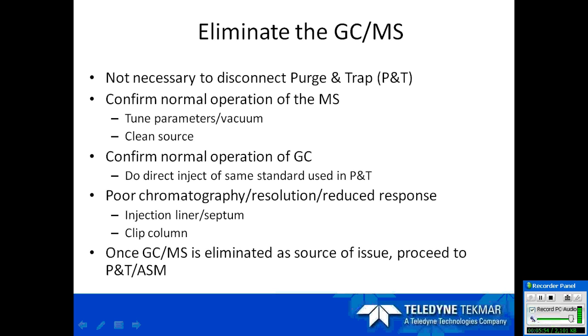Then once you confirm the normal operations of your mass spec and GC, you can then proceed on to the Purge and Trap and the auto sampler.